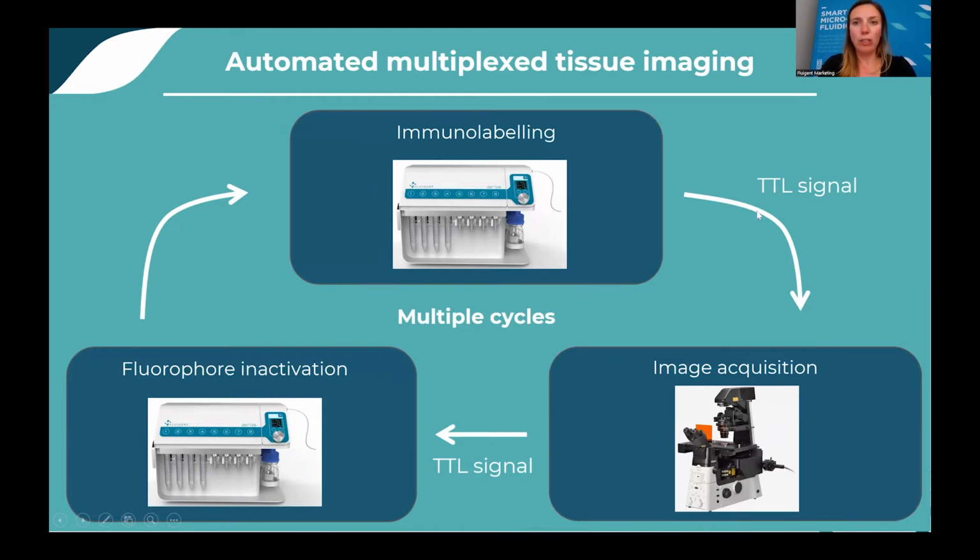And so ARIA communicates with the microscope through a TTL signal that is sent and received to launch the acquisition and to resume the perfusion sequence.